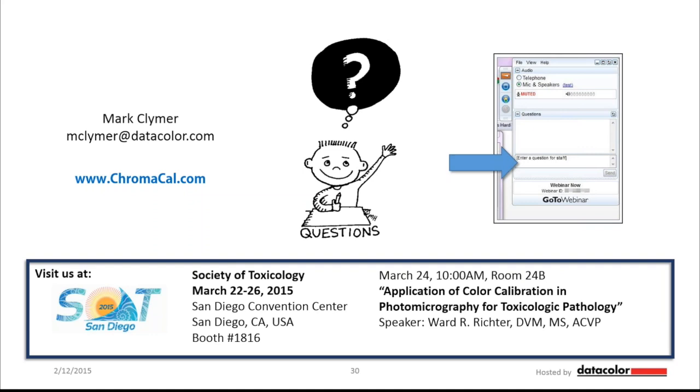Yeah, I'll address the ability to use the slide in fluorescence, and unfortunately, there's nothing on that slide that is fluorescent. It's intended for transmitted bright field. We have people asking us if it's also suitable for reflected light, but unfortunately, it's transmitted only.